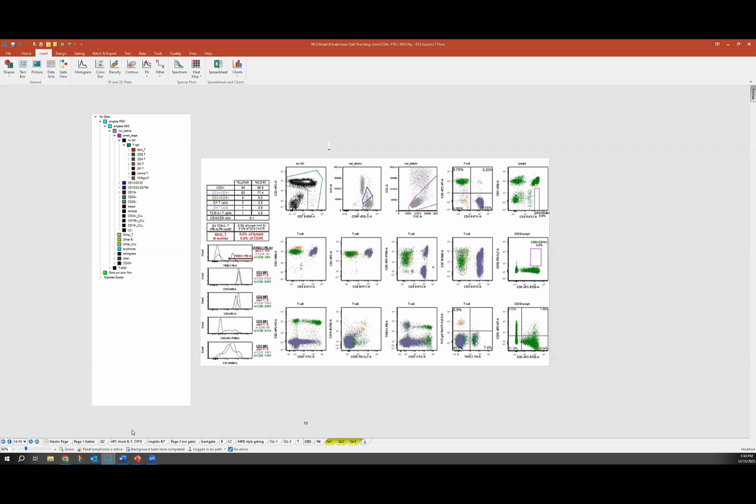And here's one of the case studies to show how one of the analysis templates functions for T cell analysis. One of the first things that we do when assessing for T cells is start by assessing the CD2 by CD7 gate, the overall fraction of T cells, and the CD4-8 ratio shown here. Here you can see that the 4-8 ratio is quite high.